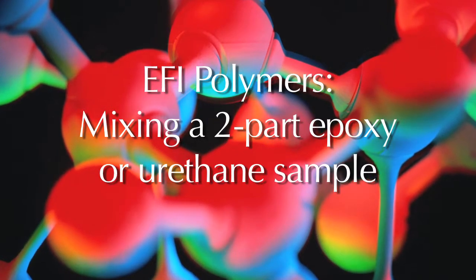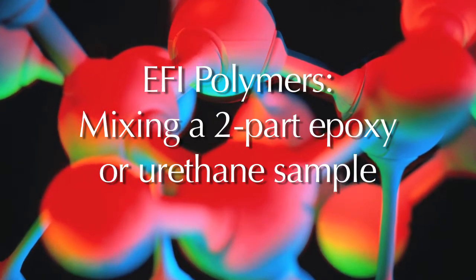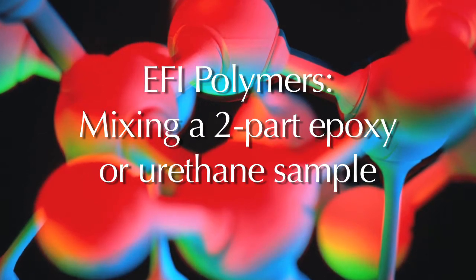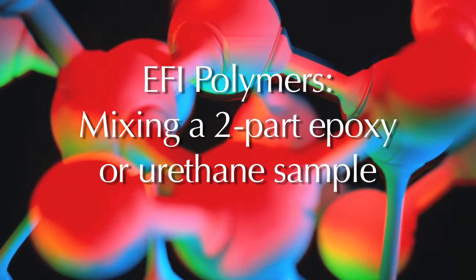This tutorial will explain how to handle, measure, and mix two-part samples of epoxies and urethanes from EFI polymers.